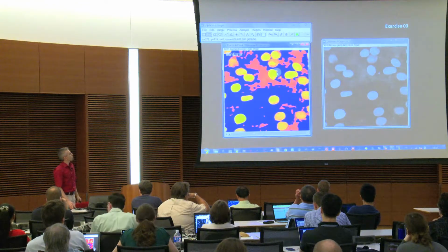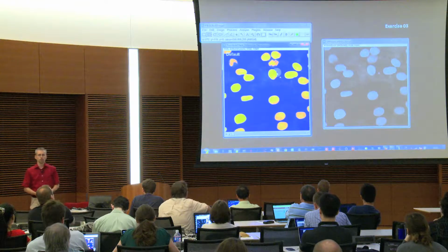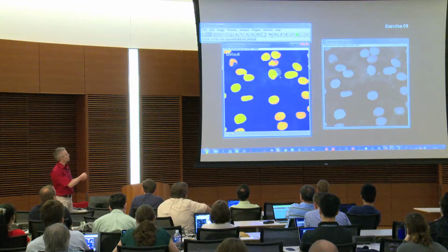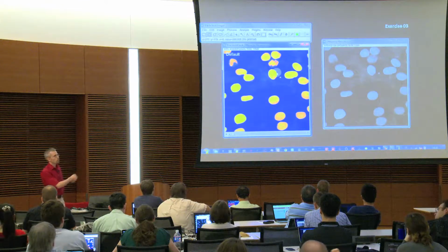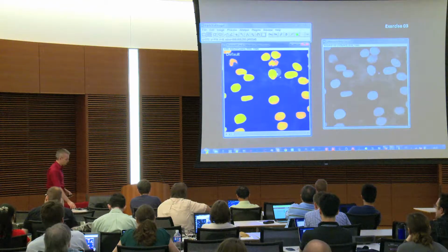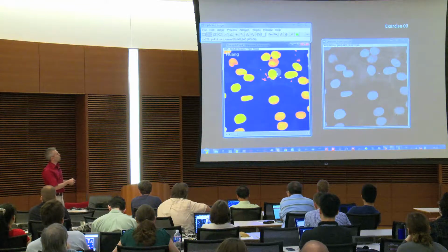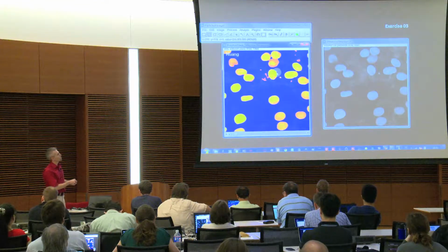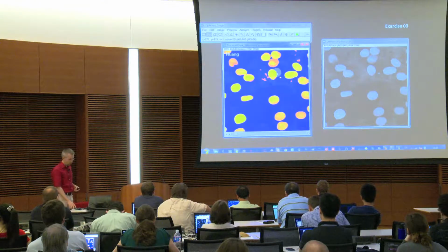For example, Default doesn't look bad, but if you look closely, it's actually telling you, okay, here there is a complete nucleus, and here as well, and we don't get that completely. So that is already not the best one, even though in the beginning it looks good. Here, it's better, we get them completely, but we also get additional things, so we should potentially have a look further.